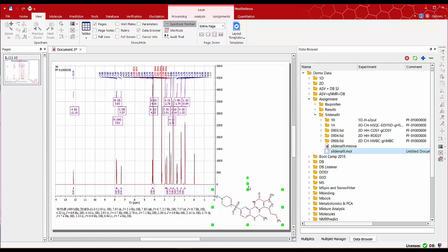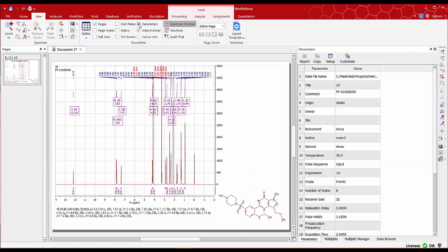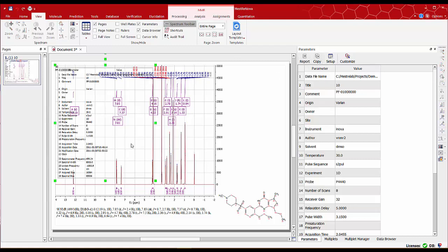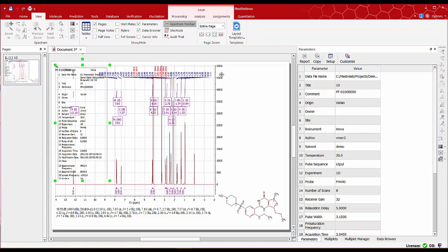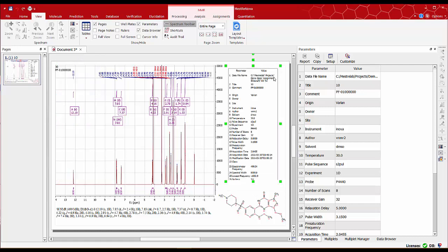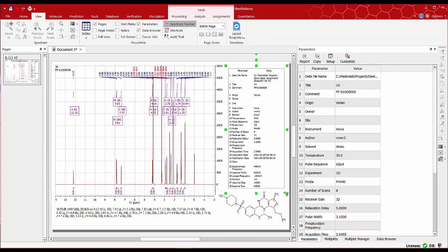You can report the parameters just by selecting the checkbox in view parameters. You can also resize this information to fit your spectrum display. As you can see all the different objects displayed can be resized and moved around as you wish.